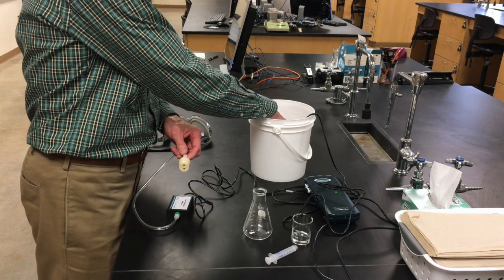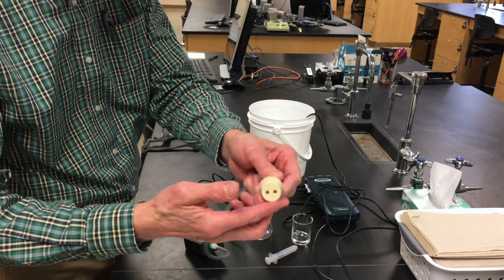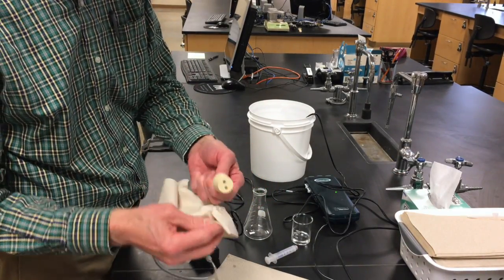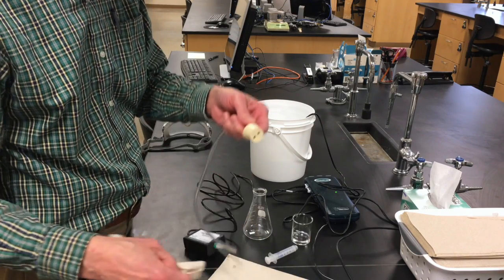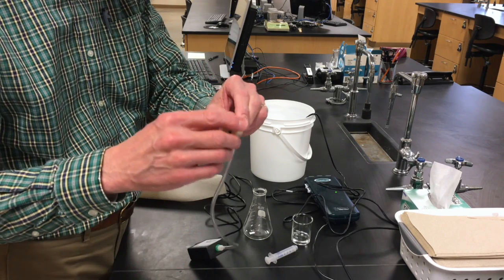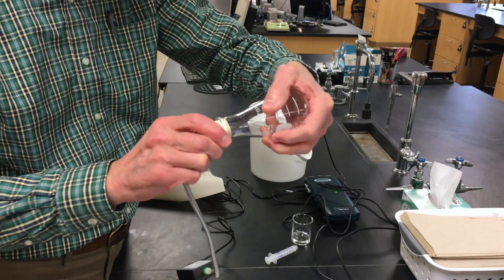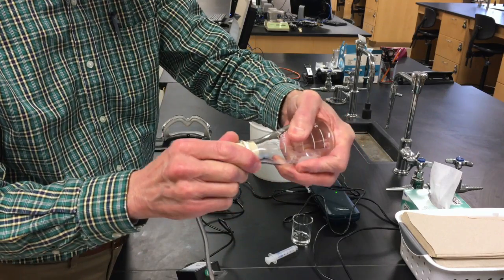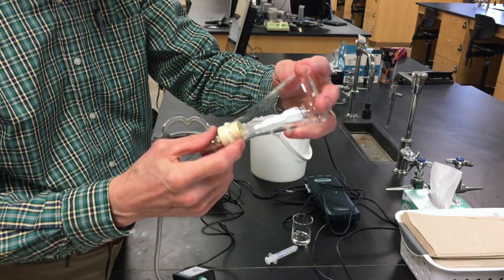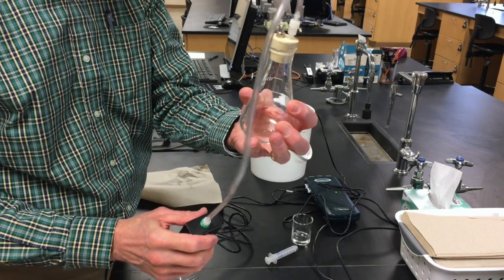I'm going to get a little water from this water bath on my finger and wipe it around on the outside of the stopper, just the outside, not the bottom. And then I'm going to dab it with a paper towel to make sure that there aren't big water droplets on it. But I didn't dry it, I just dabbed it. So you can see it's still wet all the way around. And then I'm going to twist it in there good and strong. And maybe you heard a little squeak there. That's good, and it's good and twisted in there, and you can even look around here and see that it's sealed all the way around. So that's a good seal.